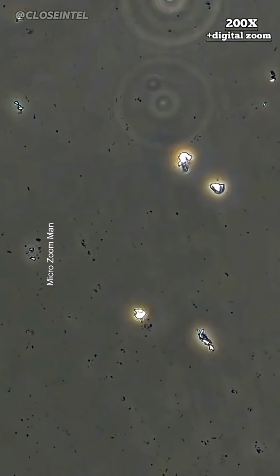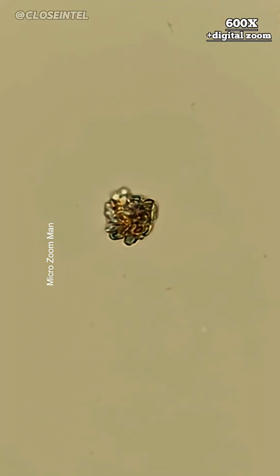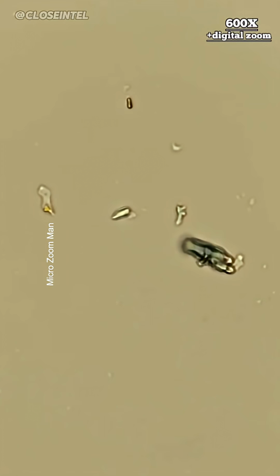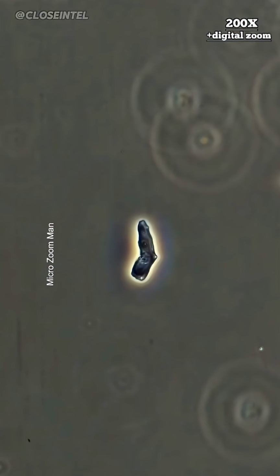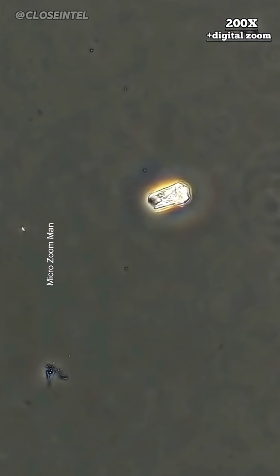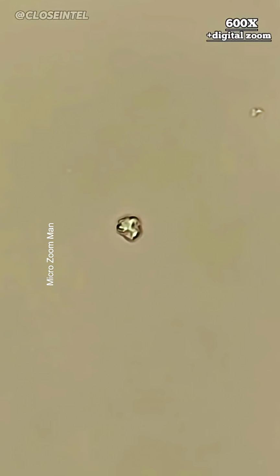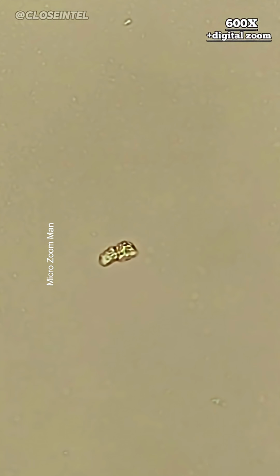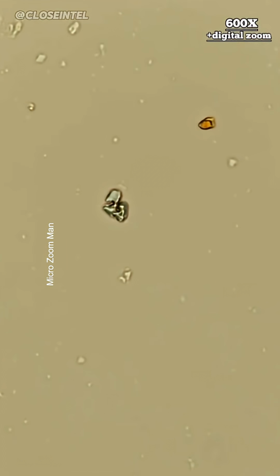Under the microscope, the first thing we notice is a variety of small, non-living debris. These particles all differ in color, size, and shape. Some are even too small to make out clearly. These are typically fine sediments or tiny bits of organic matter. Now, all these tiny particles we've seen might look surprising, but even with treatment, it's nearly impossible to remove every single speck. The important thing is that this common debris is generally harmless and present in such small amounts it doesn't affect the water's safety.